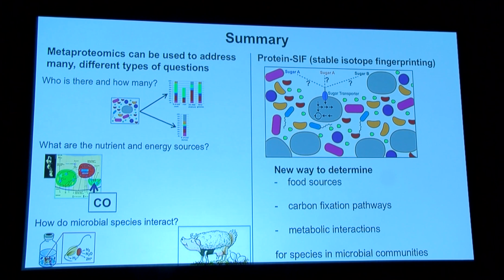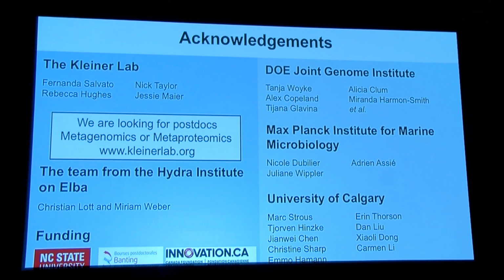Yes, so in summary, there are many different questions that you can address with metaproteomics. We developed this Protein-SIF approach that now allows us to look at the food source and carbon fixation pathways for species in microbial communities. And with that, I would like to thank you for your attention and the many different people that were involved in this work.